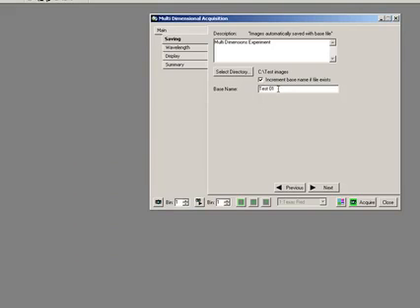Now in here I put a base name, and that says test01. So every time I do an experiment or do anything, it's going to save as test01.